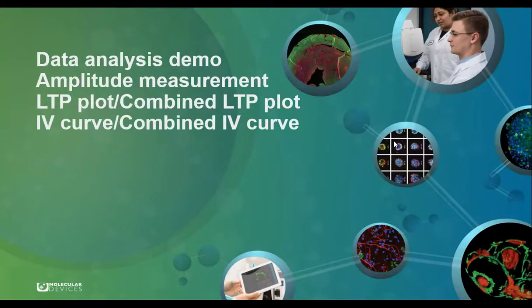Now I'm going to do some data analysis demos to show you how to do the data import and also the data export and also the macros. And also I will do the demo to show how to do amplitude measurement and LTP plot, or combine the LTP plots in one graph. And also I will do the demonstration for IV curve and combine several IV curves to one IV curve.